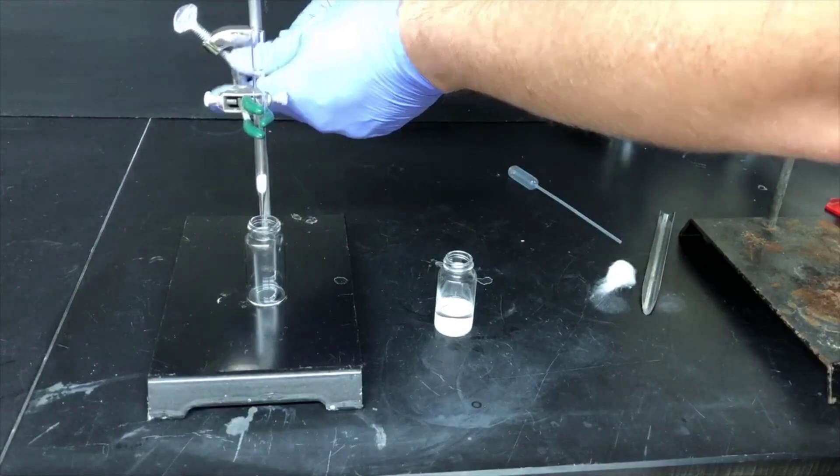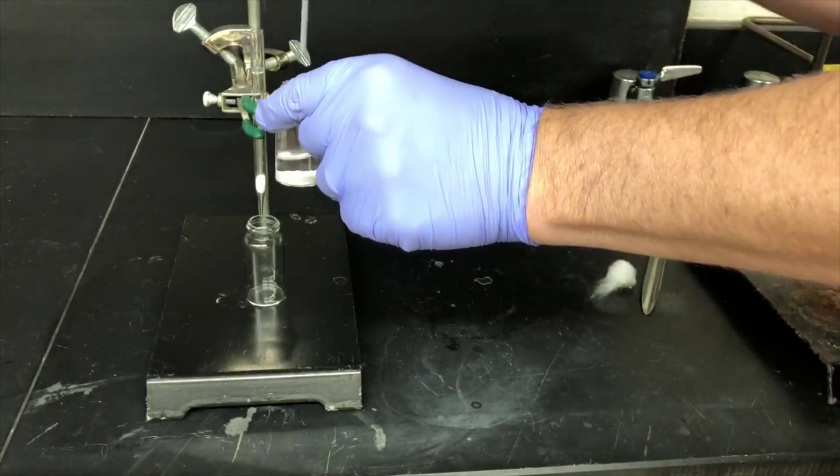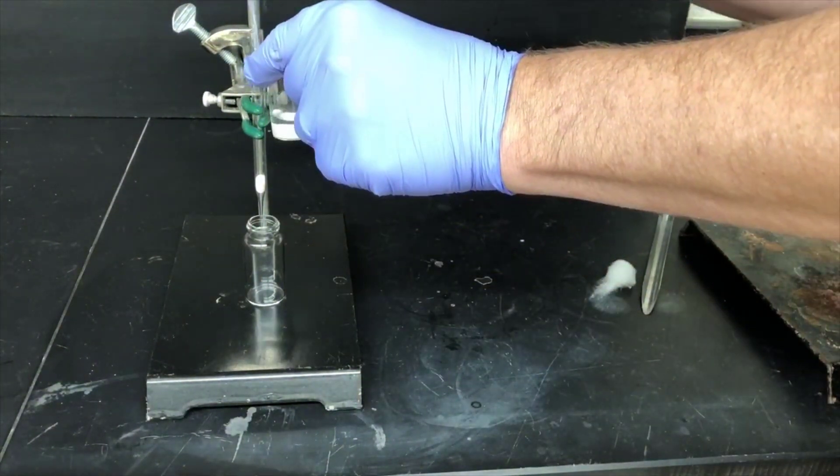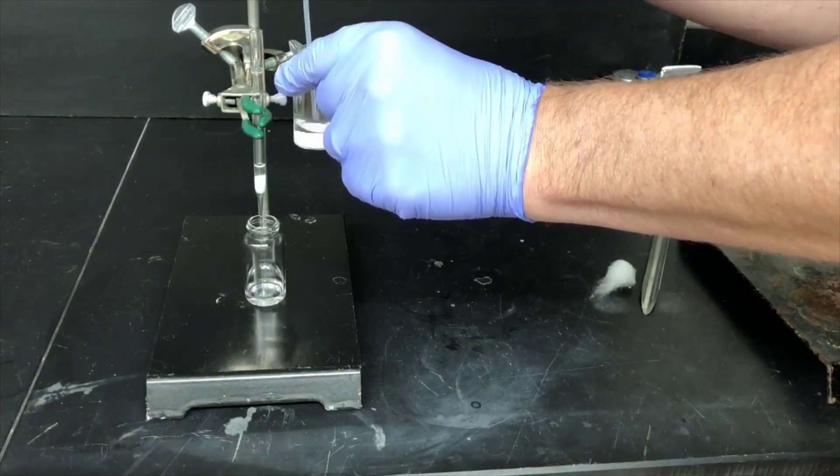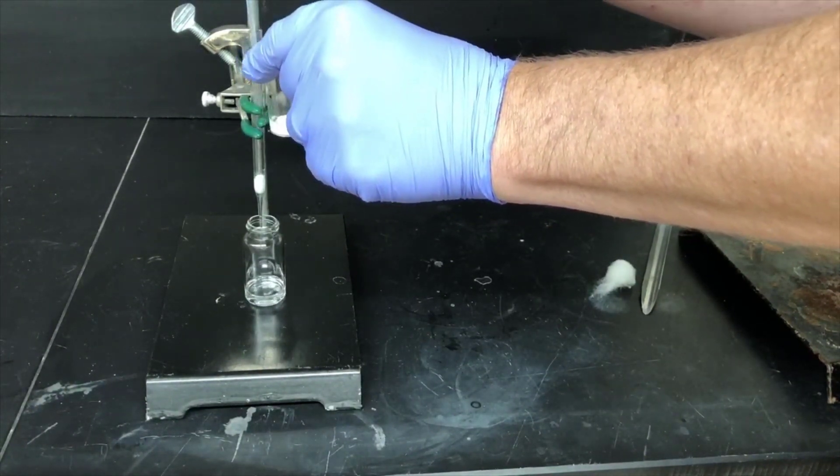Then I'll clamp this to a ring stand, and then I'll pipette the solution with magnesium sulfate through this pipette. The cotton will filter out any of the magnesium sulfate that makes it into the pipette, and the solution will come through clear.